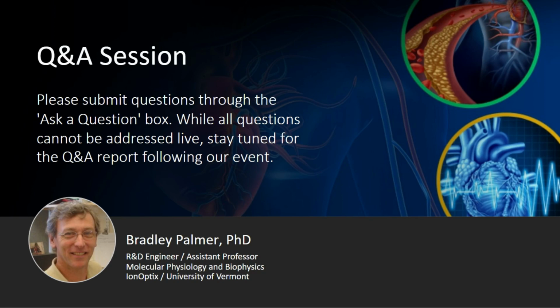We've been able to also keep these slices in the refrigerator overnight without being oxygenated, and in the morning we can still collect force data from them. It's not as good as fresh, but it's still amazing that they are still quite viable even without being continuously oxygenated. So that's what I mean by robust.